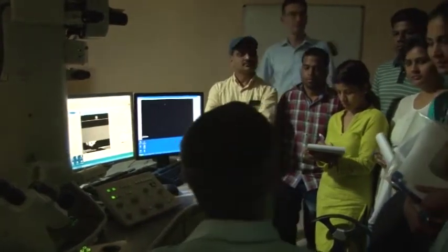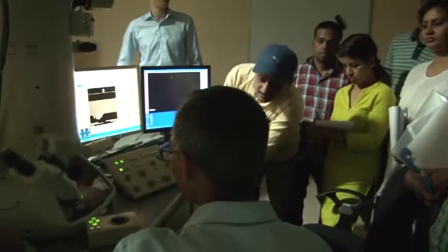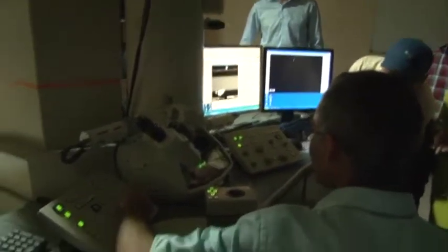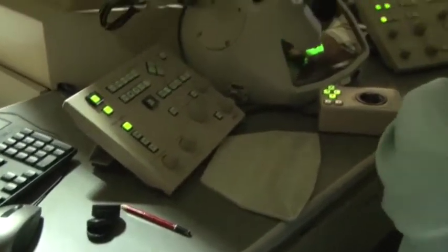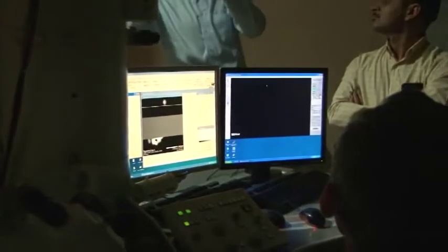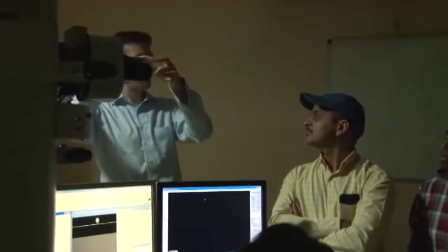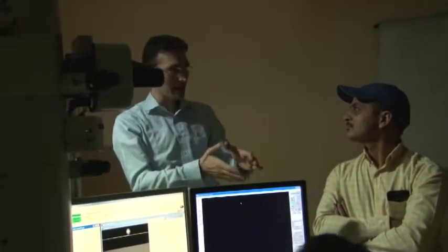Then sir, how will you identify? Yeah, it's a good question. Do it like this. Focus it. When we focus it, it is at the center. Only when it is spread does it go away. This is an indication that that is the problem. If the aperture is off from the optical axis, then you select electrons passing through the condenser which are off the optical axis. Meaning, if you focus the beam now, because they pass under a certain angle through the sample, they might be centered.